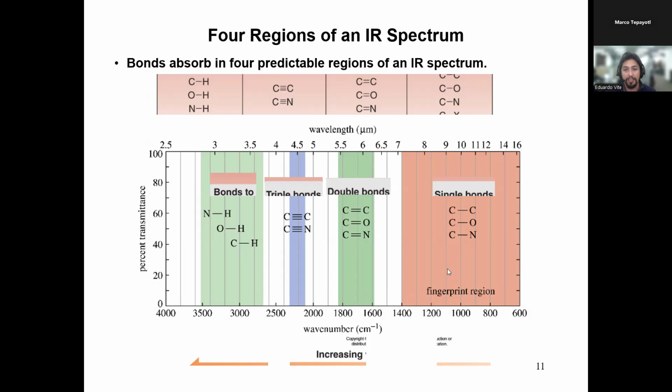So you'll usually see a band in between these regions that will be a carbon-oxygen, carbon-nitrogen double bond, and it has a very large absorption. So it is a very strong peak, and depending on what sort of molecule is there, you can often see that it is going to be either a little bit broad, a little bit round, but sometimes it's very sharp. So again, you don't just look at this blindly. You kind of have an idea what your molecule is, and this is more of a way to confirm it.